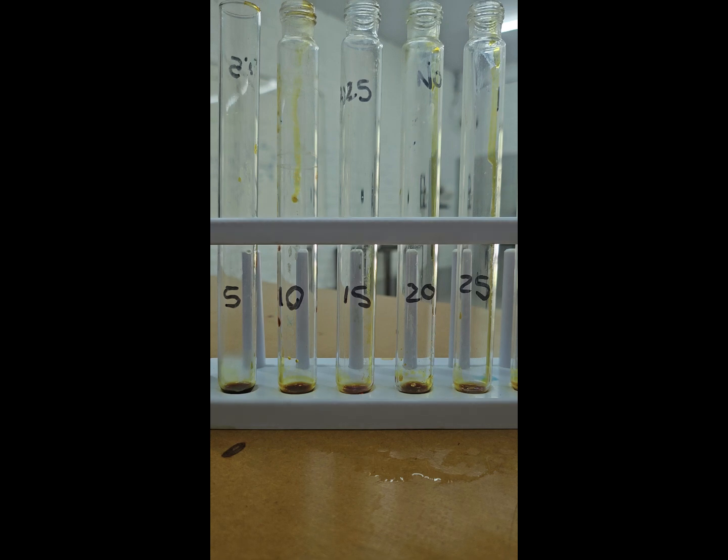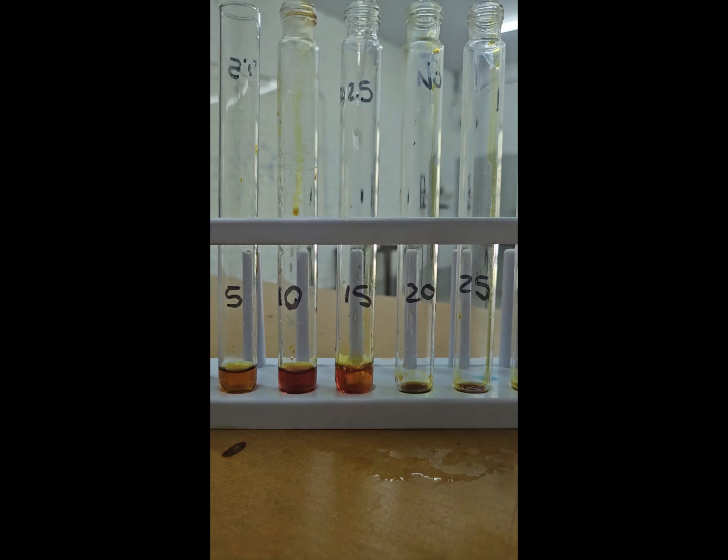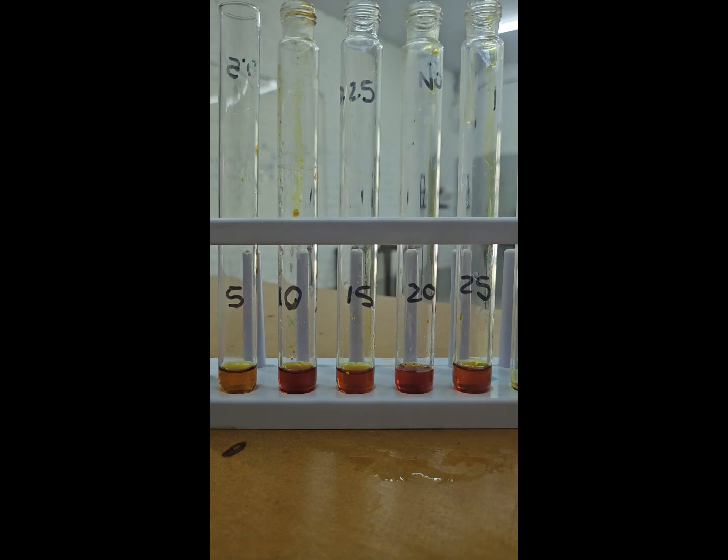In each test tube, I add the same amount of iodine and water to create an iodine solution. When setting up this type of experiment, I need to remember to keep all other variables that I'm not testing for constant. That is why I used the same temperature for the solution, and the same enzyme and concentration of enzyme for the solution. My iodine solution is the same volume and the same concentration for all my test tubes.